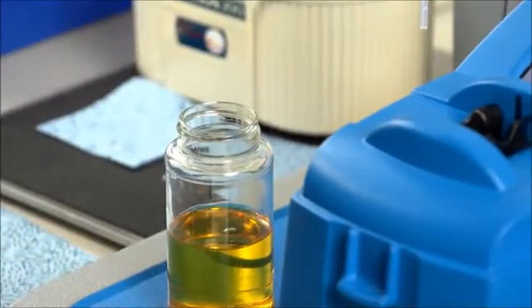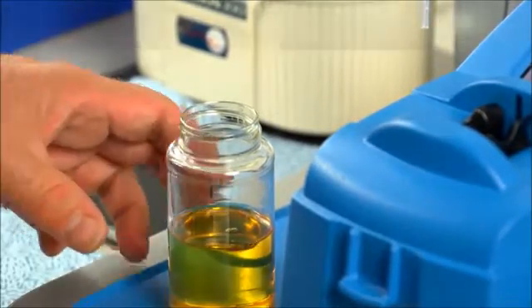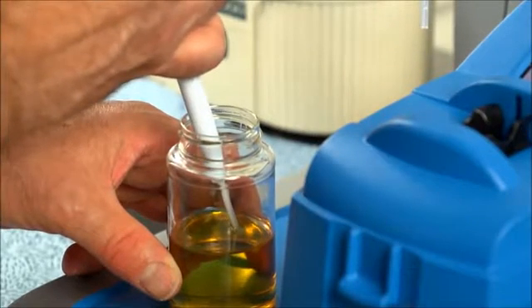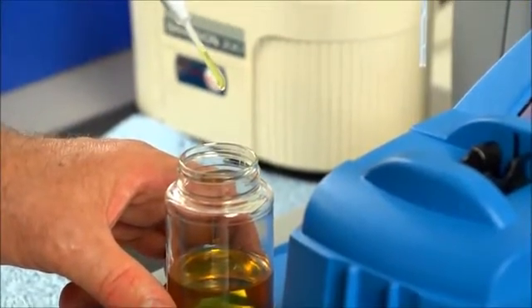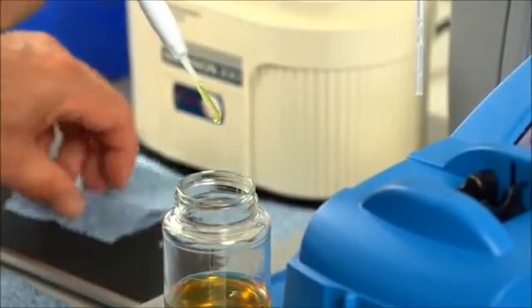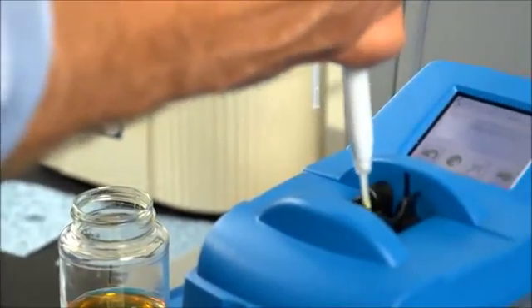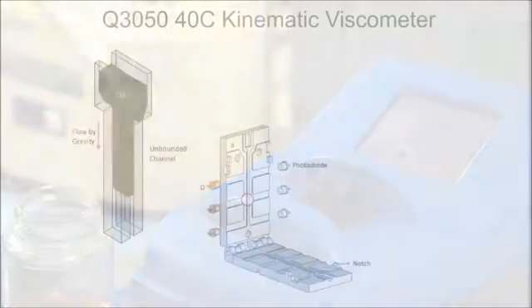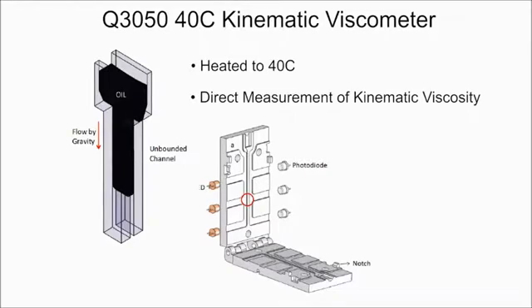The Minilab 53 uses a spectrovisc viscometer, which measures 40 degree C kinematic viscosity. We simply take a single drop of oil and drop it into the viscometer. Parallel plates heated to 40°C give you a direct measurement of kinematic viscosity.